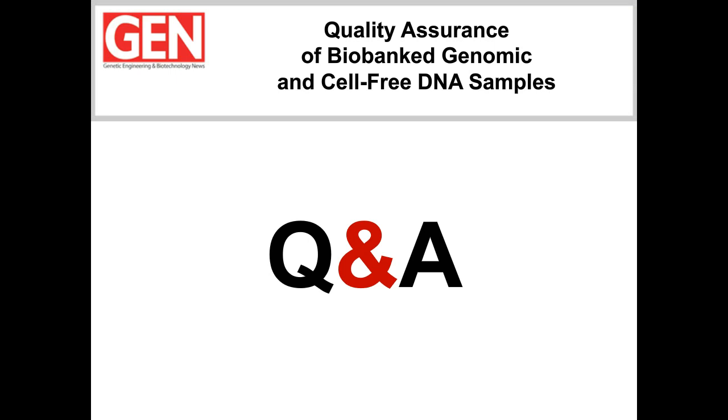All right, and looks like we have two more very technical questions for you, Rainer. What is the shelf life of the screen tapes? Shelf life is at least 4 months in the hands of our customers, and if you have already pre-used one screen tape and there are empty lanes or unused lanes left, we specify that the screen tapes are good for another 2 weeks after the very first use of the screen tape.